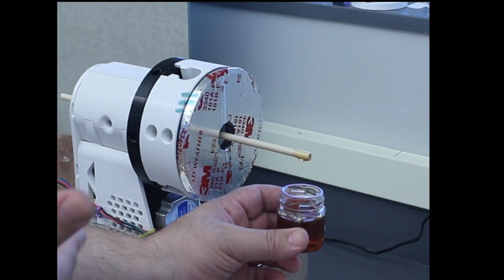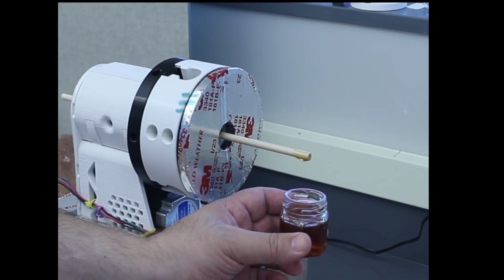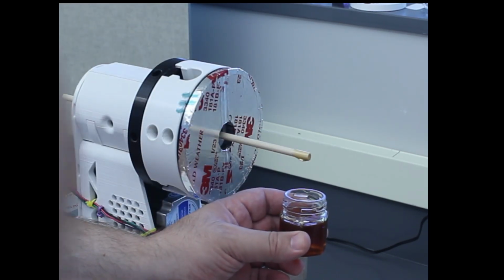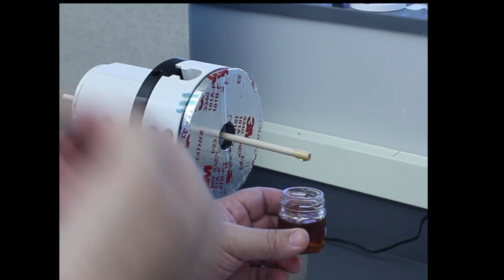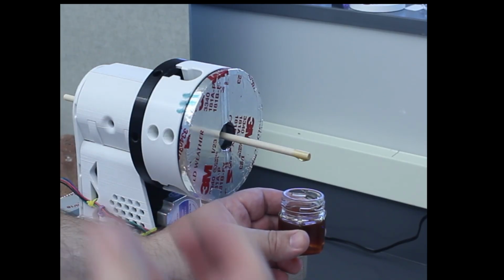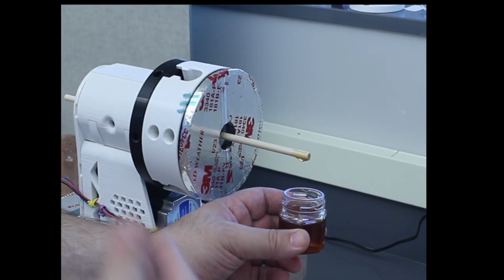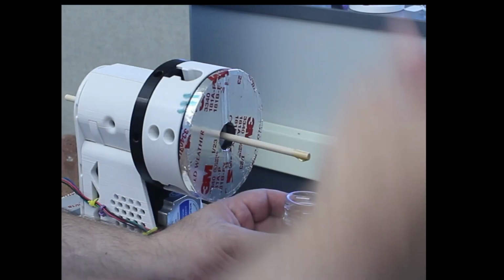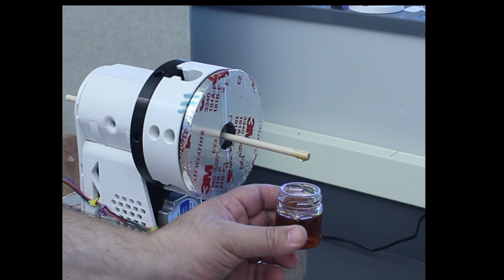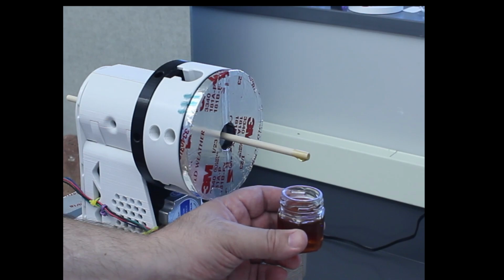And this is the kind of demo that you can use to show students and other people how scientific glass blowing works, how the glass flows like honey while it's heated. And that's one of the reasons why, especially artistic glass blowers, when you watch them, their movements are very dynamic, very fluid, where they're always rotating the glass. They're always moving, because if they stop moving, it will start to drip like this, the glass, and you're done. So just keep that in mind.